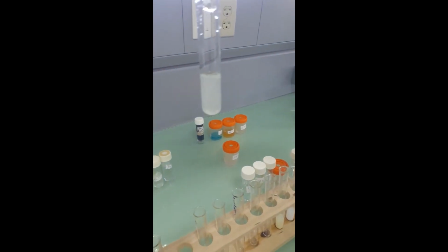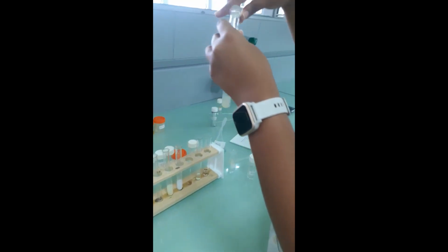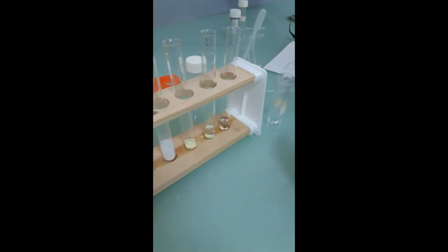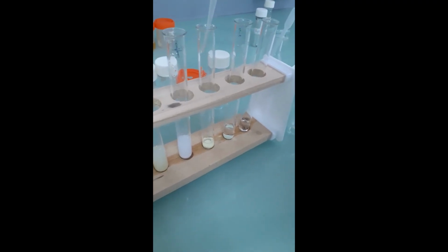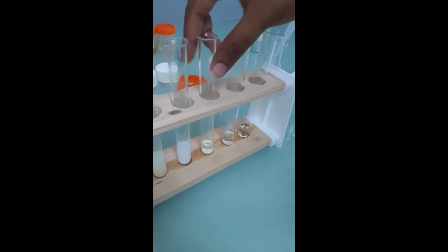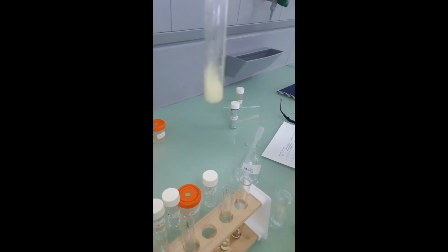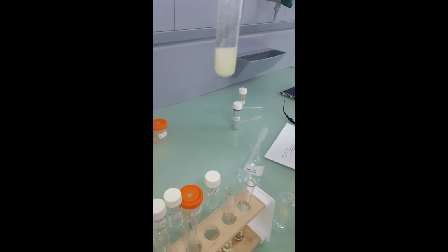Okay, record your observations. Now we're going to divide the iodide ion into two parts. To the first part we will add ammonia solution. Okay, so take your observations there.